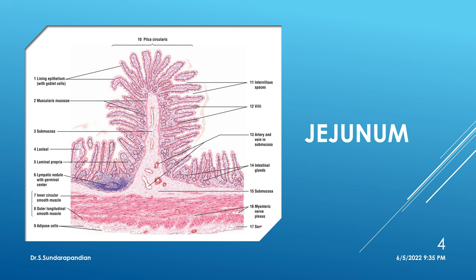Villi are present, and you can make out the plica circularis. Now see the submucosa — if there are no glands, that is the slide of jejunum. In the lining epithelium there will be more numbers of goblet cells. In the muscularis externa you have the inner circular and outer longitudinal muscle coat, with myenteric nerve plexus in between. Then you have serosa.